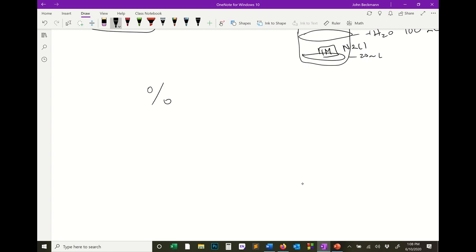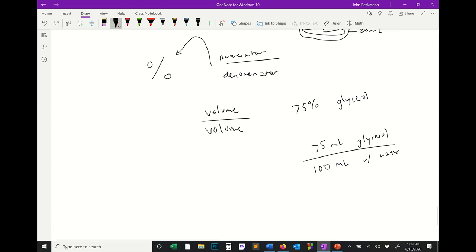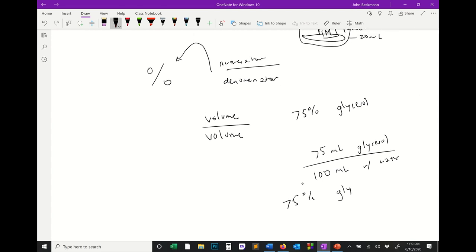Percentage. Okay, what we know about percentage is that there's usually a numerator and a denominator. Okay, that comes to this calculation of percent. But when you hear percent in the lab, in the common talk of the wet lab, it means different things. In some cases, it means volume divided by volume. So if you see 75% glycerol, that means somebody took essentially 75 mils of glycerol and made the total volume 100 mils with water. Okay, that would be a 75% glycerol solution. That's volume by volume.